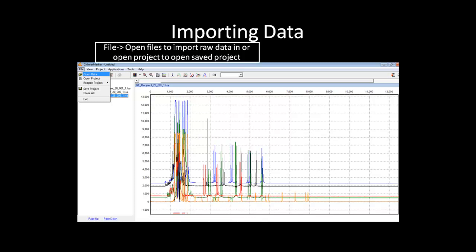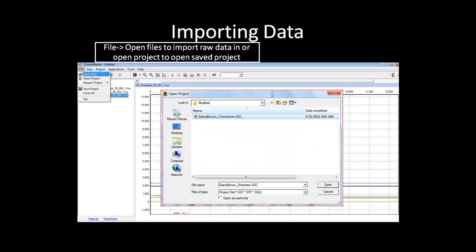In the main screen of ChimerMarker, you can use the file drop-down menu to import raw data or open a previously saved project. For step-by-step instructions on how to import raw data and run the analysis, please review the introductory webinar. I will choose to open the previously saved chimerism project and build a longitudinal report from the saved project.